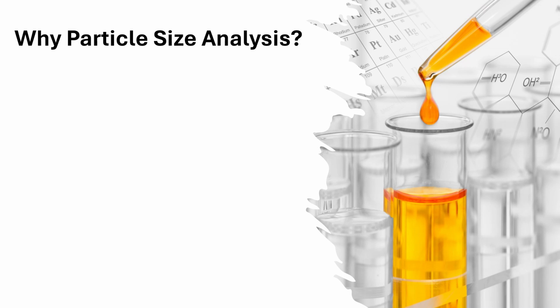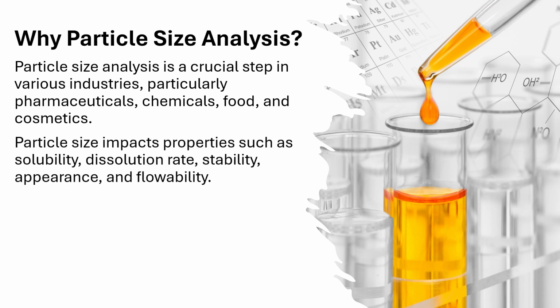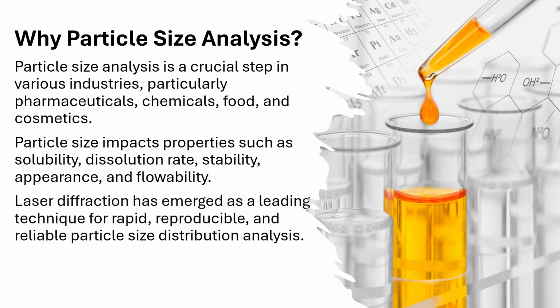So now we'll discuss why particle size analysis is being done, right? Particle size analysis is a crucial step in various industries, particularly in pharmaceuticals, chemicals, food and cosmetics. The particle size impacts properties such as solubility, dissolution rate, stability, appearance and flowability. Laser diffraction has emerged as a leading technique for rapid, reproducible and reliable particle size distribution analysis. Controlling particle size ensures consistent product performance and quality.